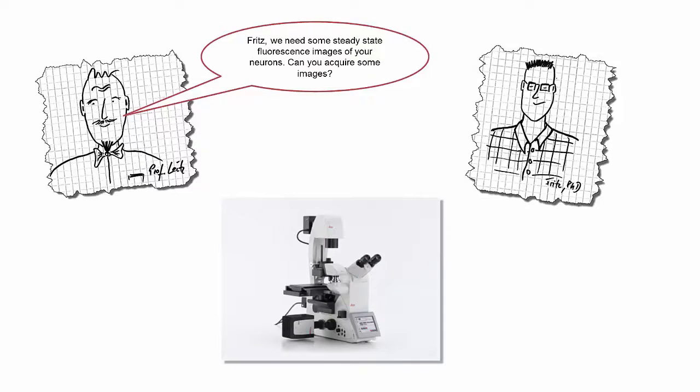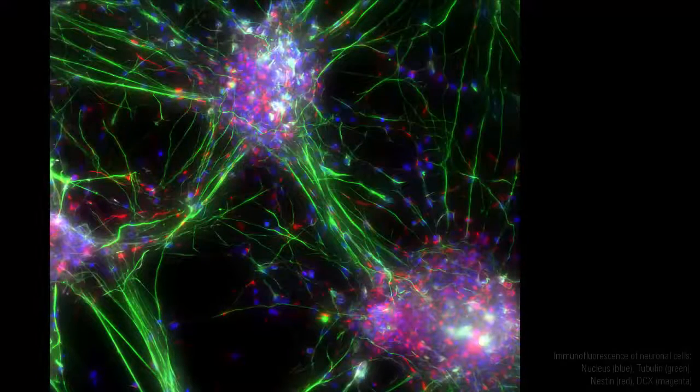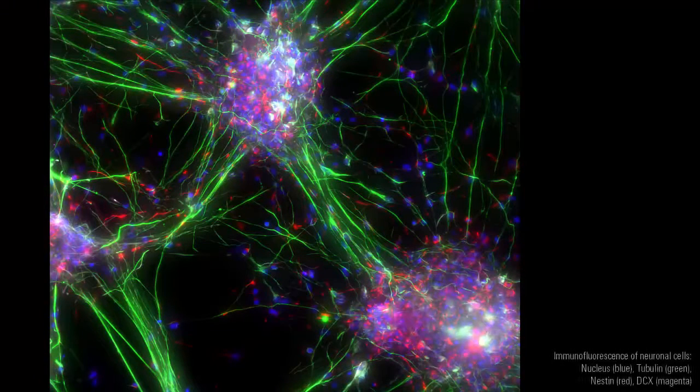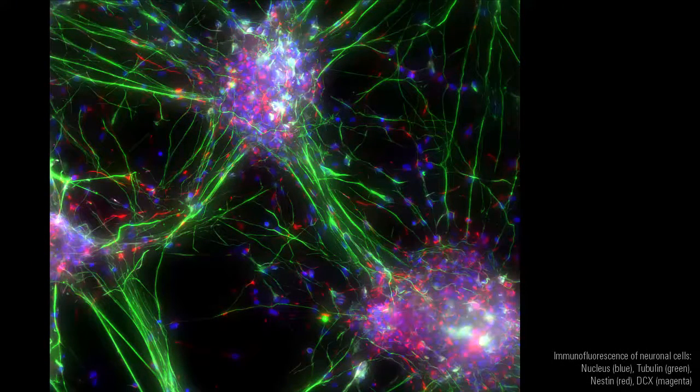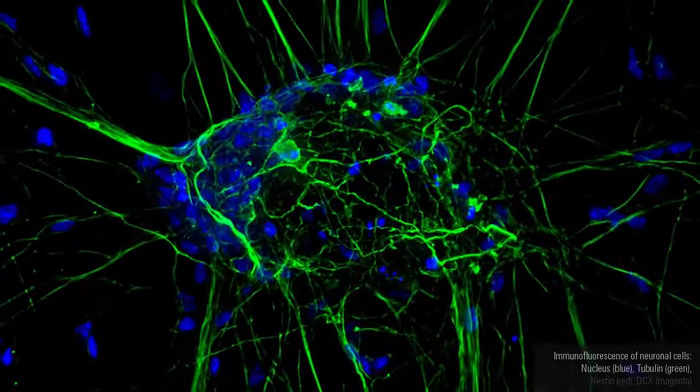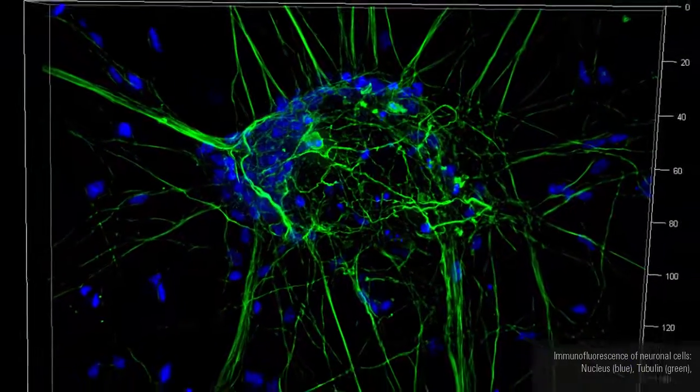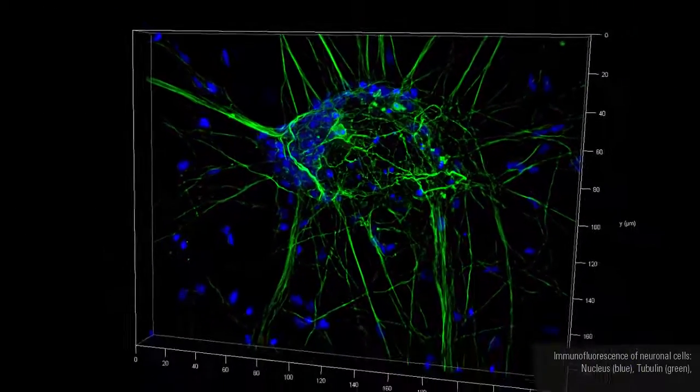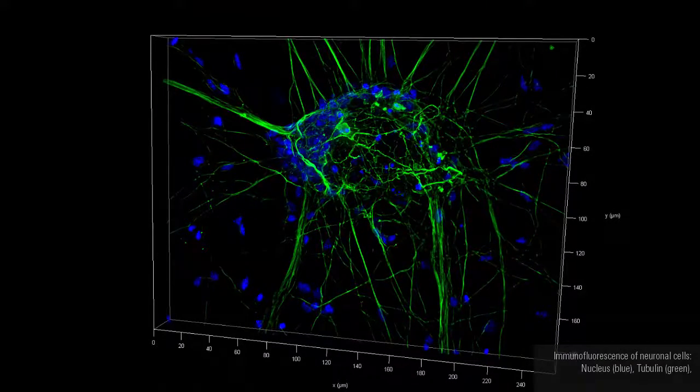Fritz, we need some steady-state fluorescence images of your neurons. Can you acquire some images? Sure, it's a piece of cake with our Leica DMI8. Fritz has used the Leica DMI8 to acquire these images of four-color fluorescently immunostained neurons. He has also acquired a Z-Stack and made a 3D reconstruction of double-stained neurons using LASX software.